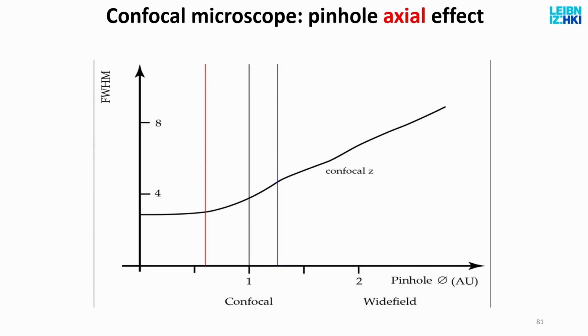So what I have to do is move this pattern at least as much as the distance between two bright lines to get a full illumination. I then have as many images as the number of scans, and each of them is striped. So this has the advantage that with a little bit of mathematics, combining these, let's say, 6 images into one, I can get a simulated confocal image. I can eliminate most of the out of focus signal.